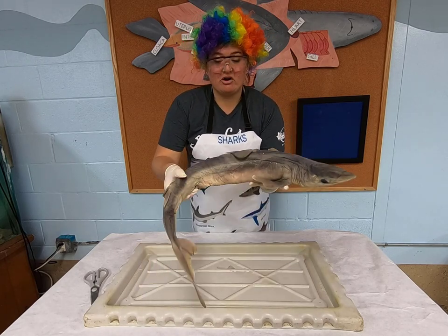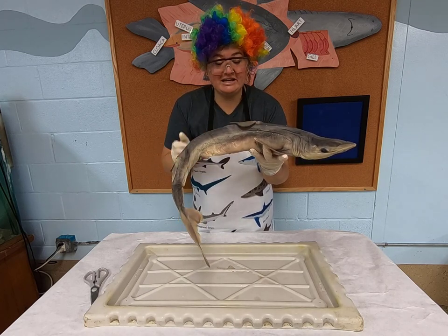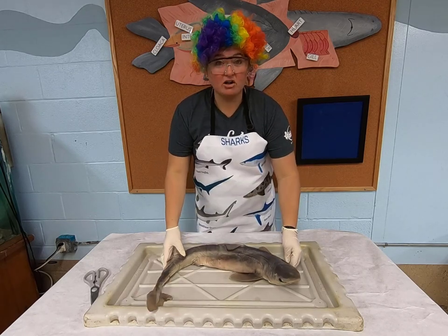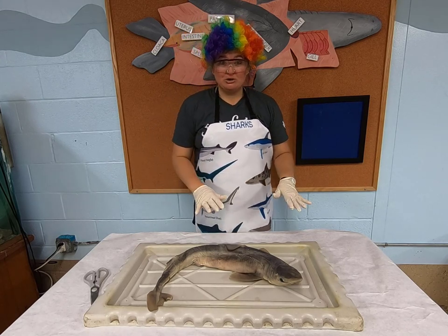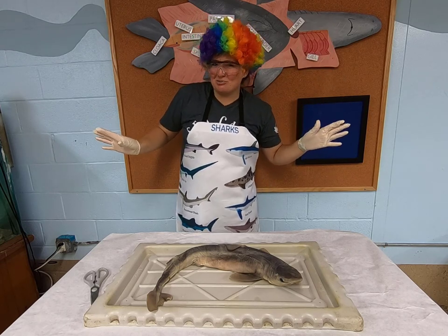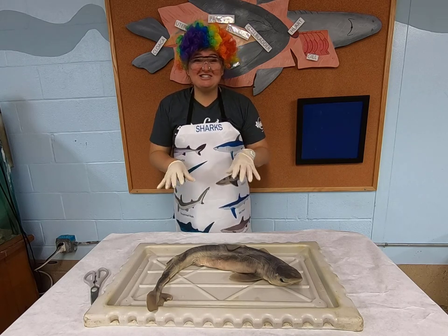They have spines on their two dorsal fins. Now, these guys have been cut off for our own safety, but they do have spines that they have, and I like to call it the Dorito chip method. These sharks are bottom dwellers. They live at the bottom of the ocean, and their predators are gonna be coming from above. Now, have you ever eaten a Dorito chip the wrong way, where you bite into it and it stabs the roof of your mouth? That's exactly what these sharks are doing.